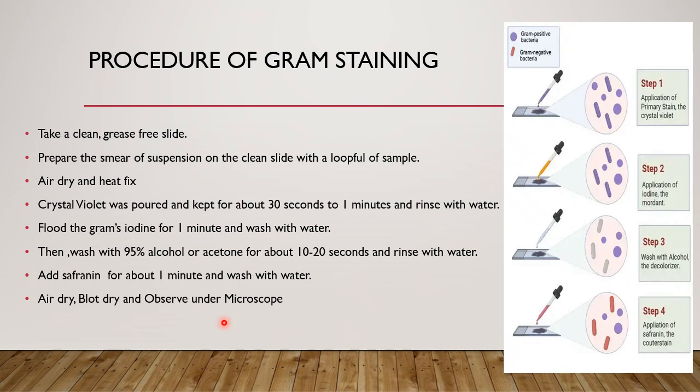And then you add safranin for about 1 minute and wash it with water. So finally, the last step is you add safranin. Again you keep it for 1 minute and then wash it with water. After that, you blot dry to remove the excess stain or water present, and then you observe under the microscope.